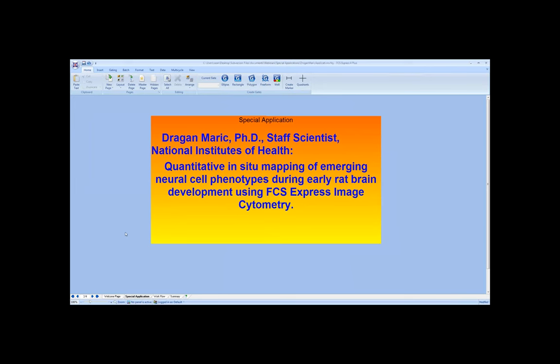Great, and what I'd like to do is introduce and present Dragan Maric. He's a staff scientist at the National Institutes of Health. He's going to be telling us about his quantitative in situ mapping of emerging neural cell phenotypes and what he's been using, CellProfiler and FCS Express, and a little bit or a lot more about the science and the interesting topics going on behind this. So Dragan, are you ready to take the presentership here? Yes, I am.